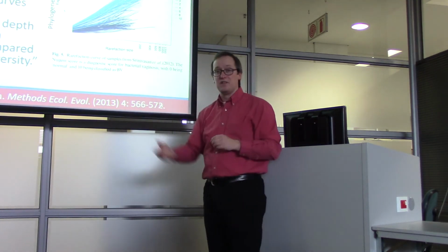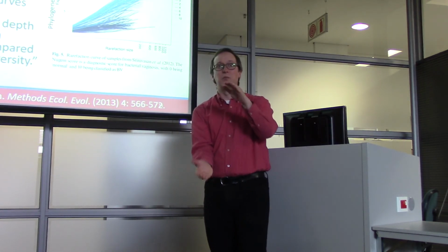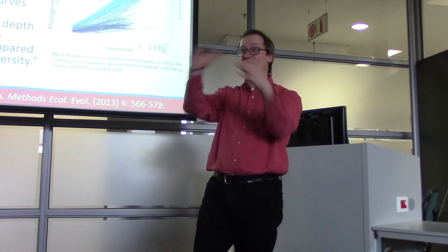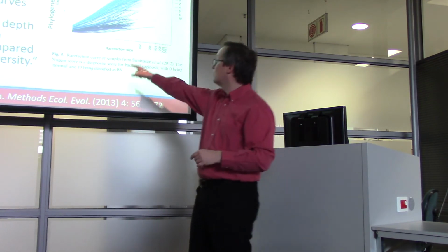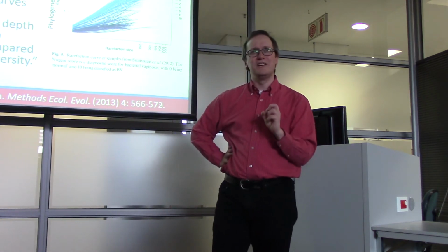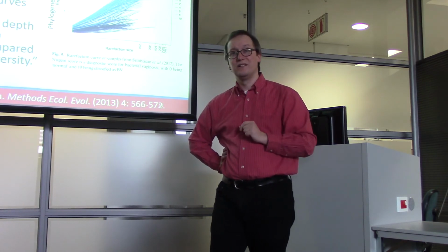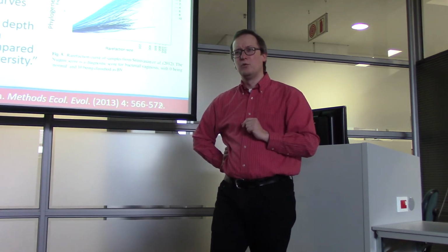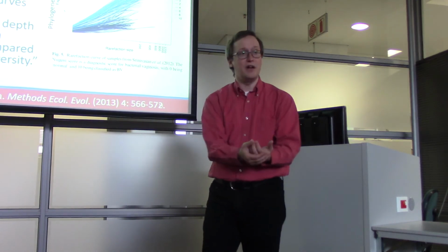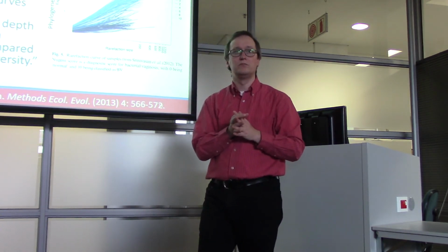If your sequencing depth were able to pick up every species that's present in a mixture, that would be brilliant. But we always feel that we are sampling that environment. We're not getting an exhaustive assessment of those species. So rarefaction curves come to the rescue. In effect, rarefaction is making your data worse to see how much the findings degrade. Everyone got that? We are going to subsample from our sequencing reads, use just a fraction of them, in order to see how stable our OTU findings were from the whole.